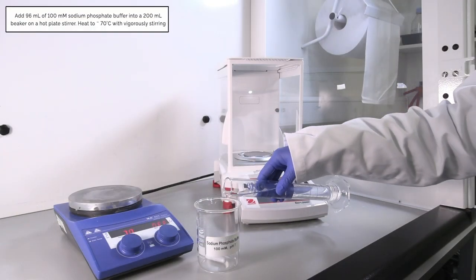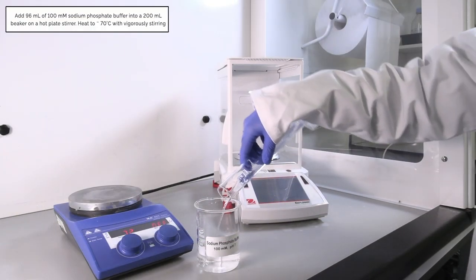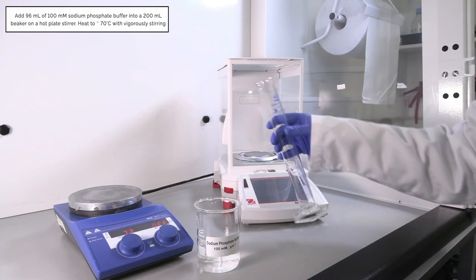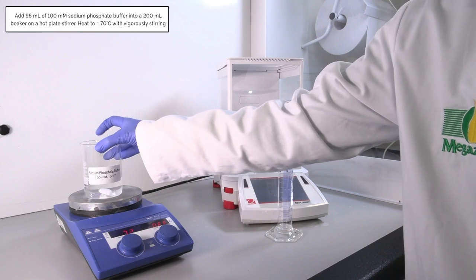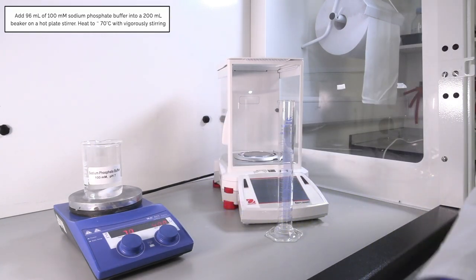Add 96 milliliters of 100 millimolar sodium phosphate buffer into a 200 milliliter beaker on a hot plate stirrer. Heat to approximately 70 degrees Celsius with vigorous stirring.